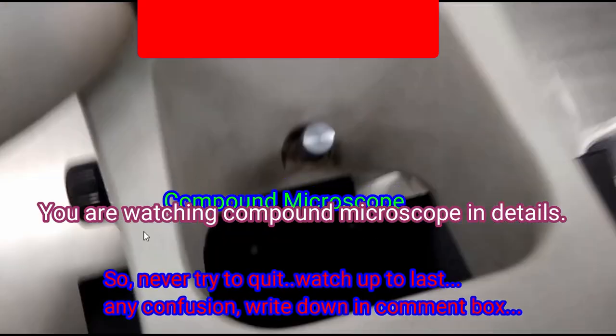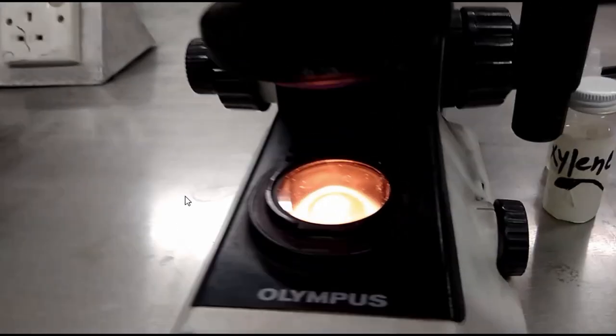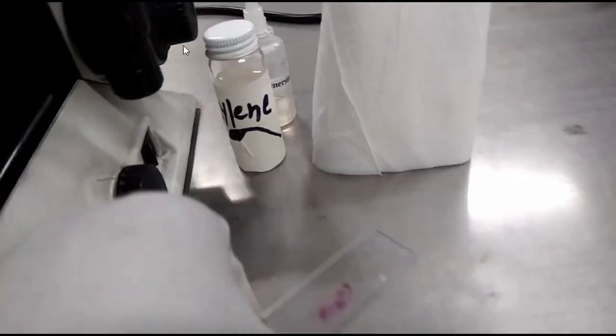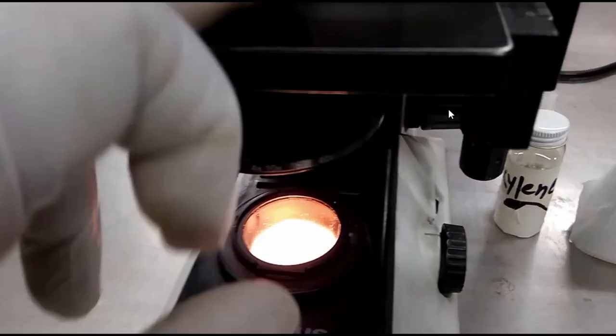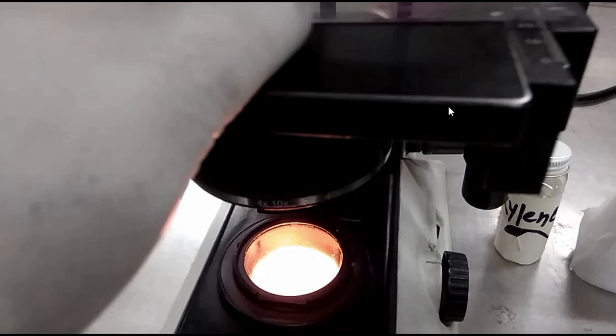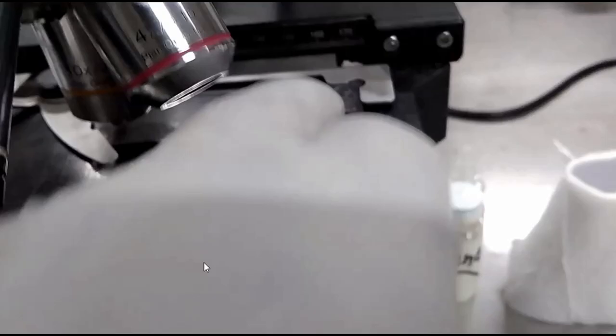Now about the mechanical adjustment of a microscope. It is carried out to focus a specimen examined by the microscope. This adjustment includes coarse and fine focusing adjustment. So this one is the coarse and this one is the fine. And condenser adjustment. Here, this is the condenser.